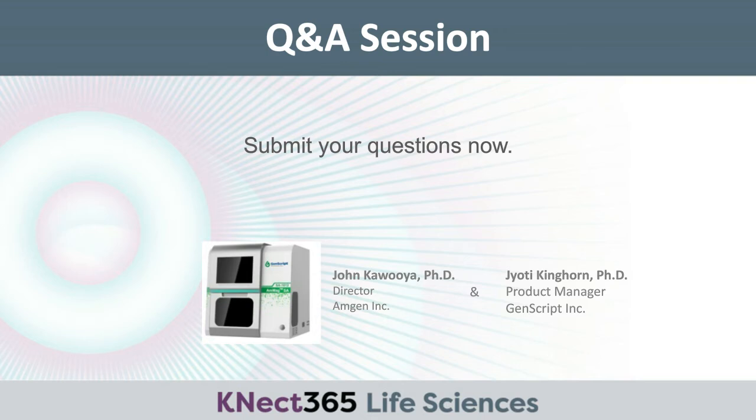Great. Thank you, John. Another question we have. Thank you for your presentation. The device looks good. Do you have an idea on elution volume? Yes, so in our device currently, we recommend a minimum of 2 ml elution volume. You can go as low as 1 ml depending on the starting volume of magnetic beads.